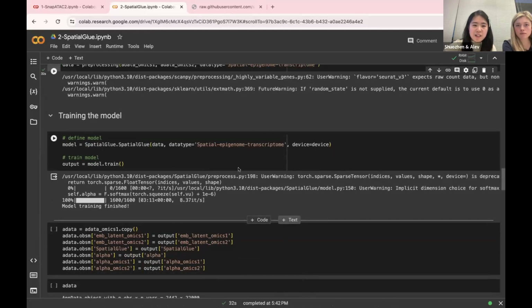I don't know how exactly this package does it, but generally speaking, for the RNA data, we have the gene expression info. The mRNA information we extract always has the gene information associated with it, whether it's a pseudogene or not. For each gene, it has a specific location on the DNA, on the chromatin. And the peak information, as I have briefly explained, is the gathered information about the DNA fragment counts within a certain region of the DNA.